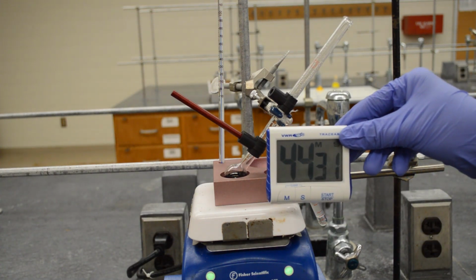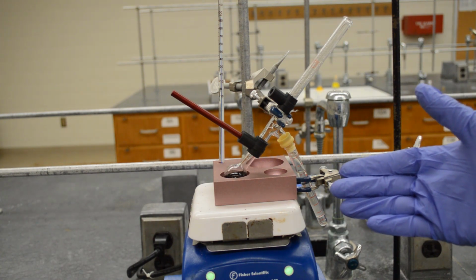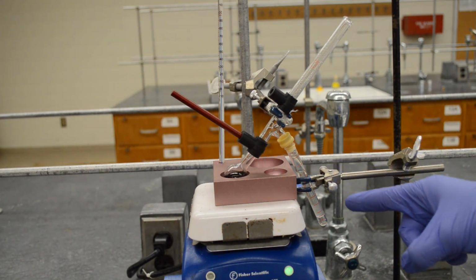Okay, it's almost 45 minutes. Our reaction should be complete by now. I'm going to turn off the heating and remove the product.